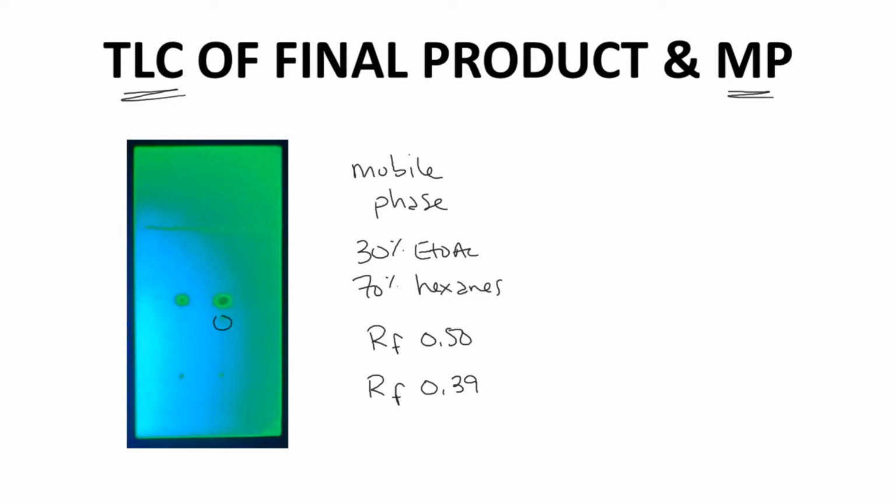Now our melting point, on the other hand, is not quite so nice. This had a melting range. Remember, we say melting point, but people report melting ranges. About 125 to 130. Now that's a pretty broad melting range, 5 degrees.